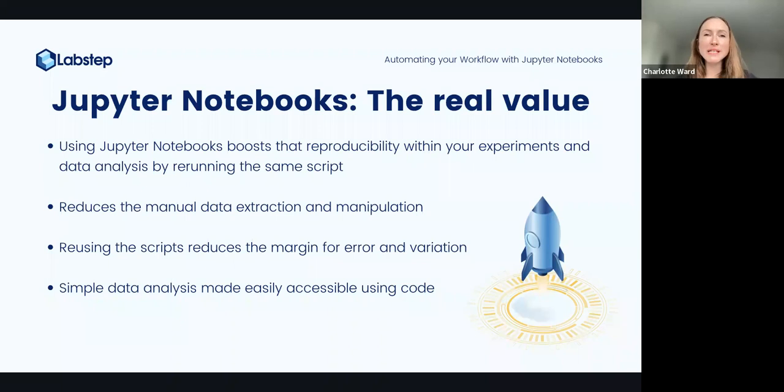Yeah, for sure. I think particularly in areas like data processing, it's very common for scientists to spend a lot of time with a lot of spreadsheets, copy and pasting values from one format into another so that they can actually do the analysis that they want to do. This kind of data structuring piece can be very time consuming, but more importantly, it can be incredibly error prone. By having these standardized procedures, it can happen almost instantaneously. And it can also take out that human error element, which could be a real risk to your analysis.